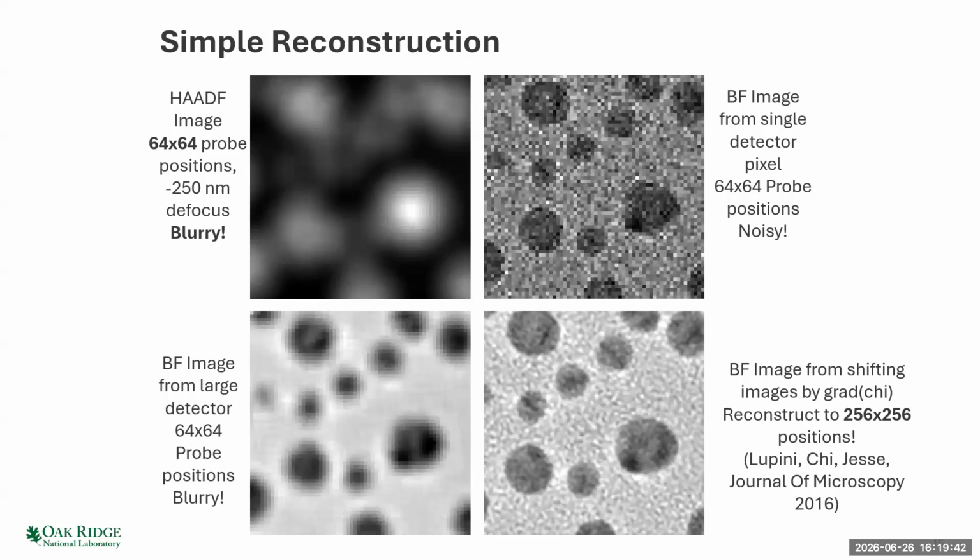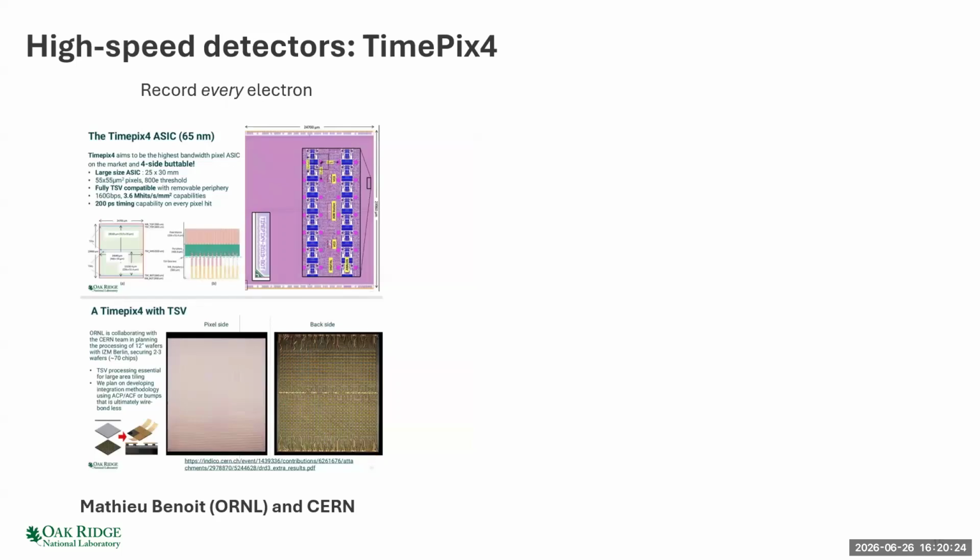composition. So we had big questions as to whether these meant anything, but I should point out we were actually the first group to show those, and then they were later popularized as tilt-corrected bright field image because each of those pixels is at a different tilt. It gives you a shift at the sample. So I would perhaps think that unless you're correcting some of the other effects, you could perhaps call it more correctly shift corrected, but then you can play games of starting to correct the other aberrations or use it in a ptychographic reconstruction.